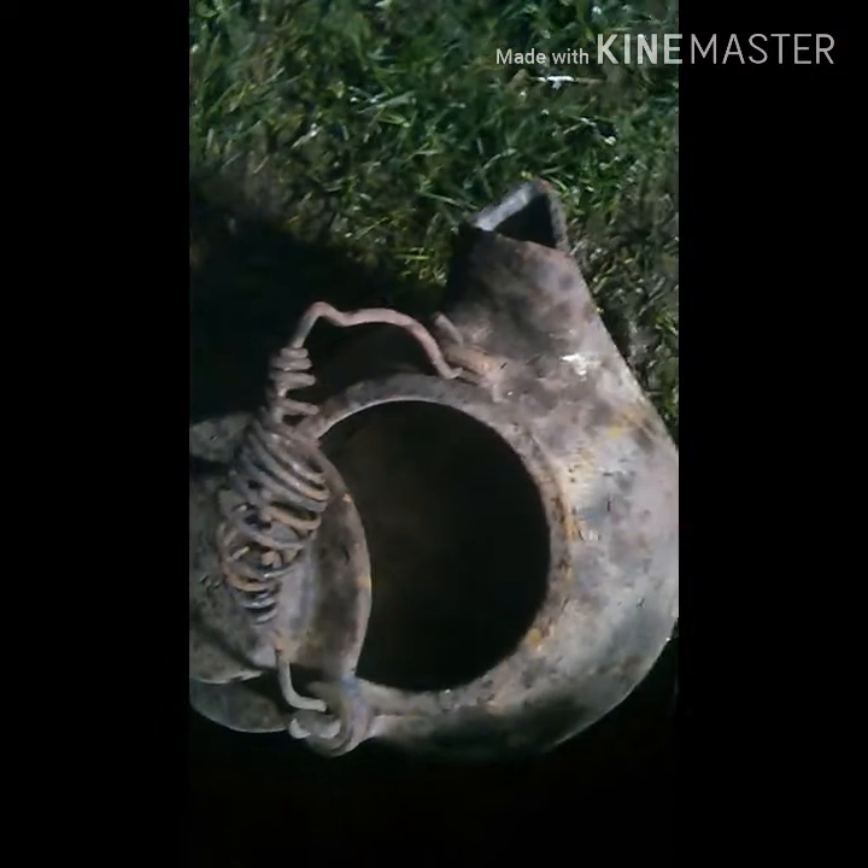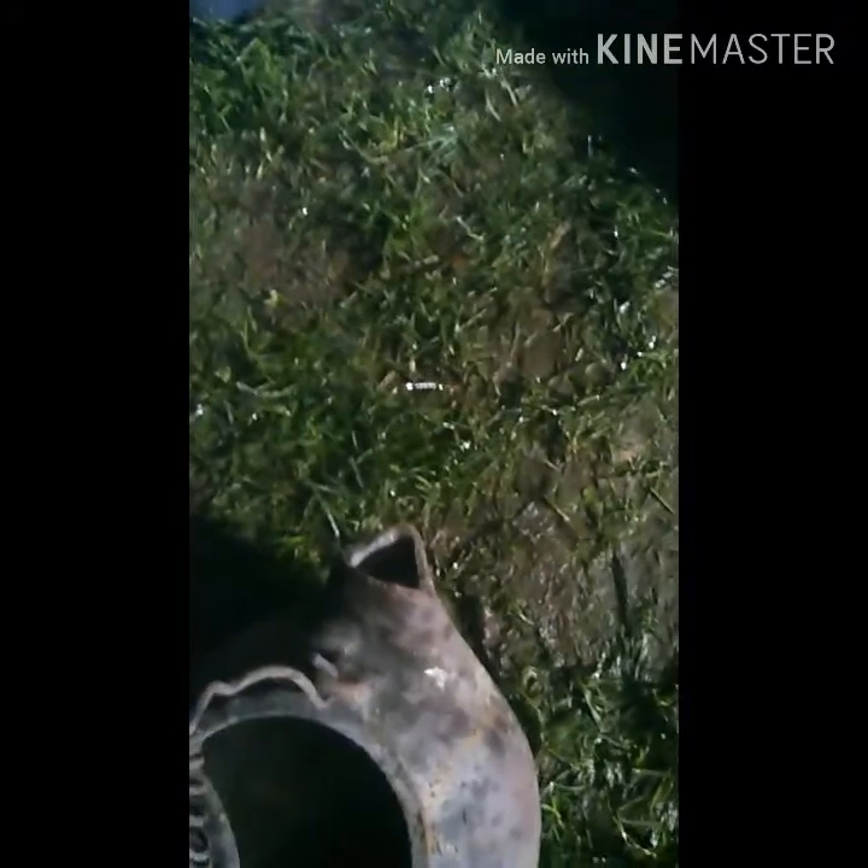I'm gonna put it in here and strain it out, then throw it into this little teapot. Once it's in the teapot I'm gonna put it over there in the kiln I made, which has the fire burning in it right now. Part of this reaction takes a lot of oxygen, and the oxygen helps it change oxide forms.